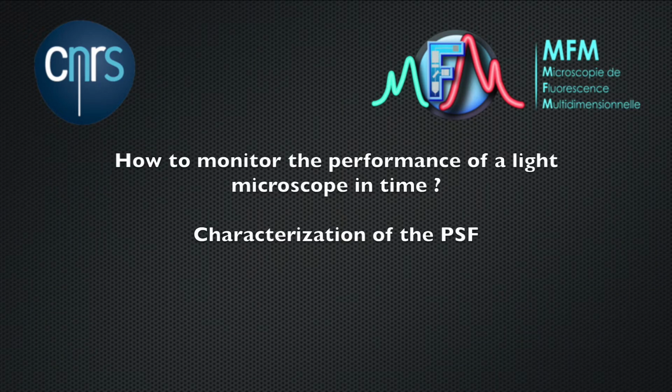How to measure the resolution of a light microscope? What is the point spread function? How to follow the evolution of the performance of a microscope lens in time? Here are some topics we'd like to throw light on with this video.